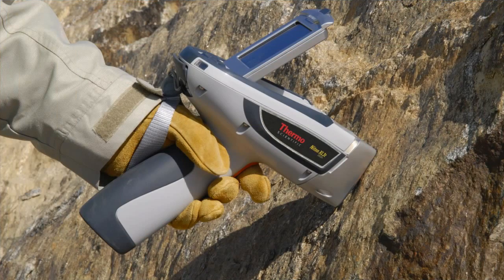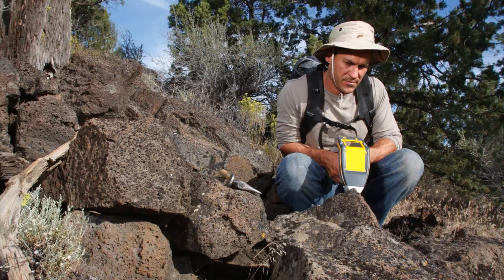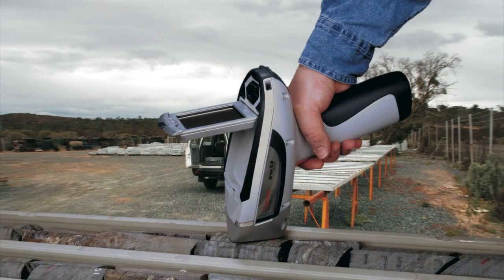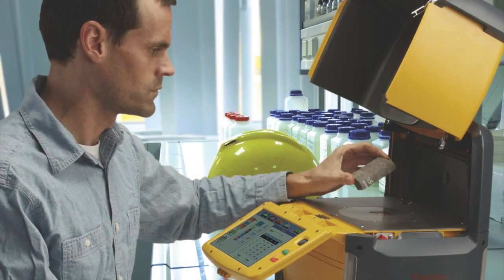Thermo Scientific Portable XRF analyzers are the latest innovations in elemental analysis for mineral exploration, paving the way to a positive return on investment.